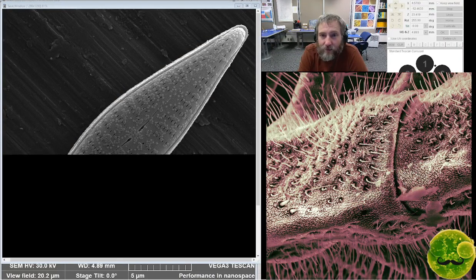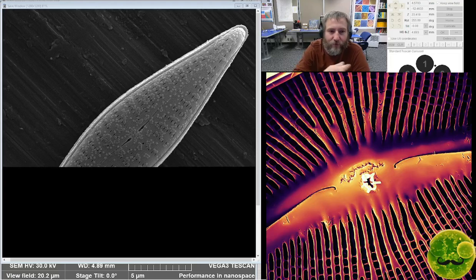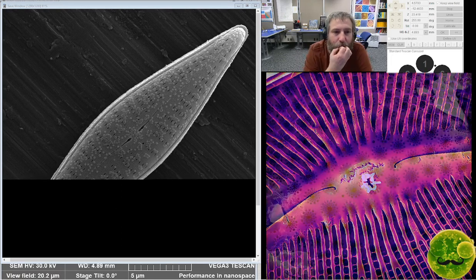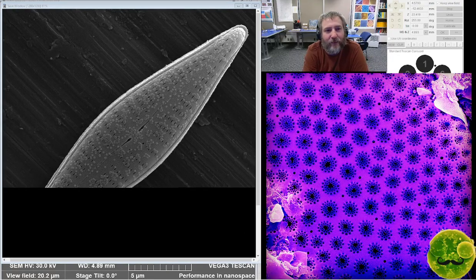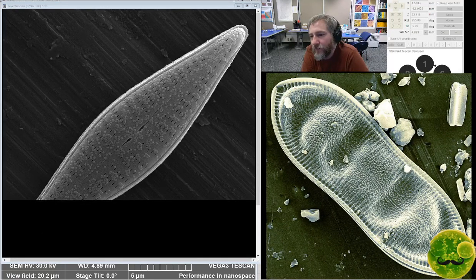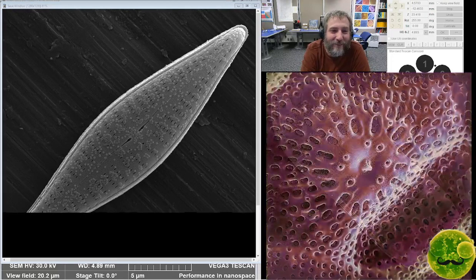the little stubs. So they basically chop them and then grind them to be flat. Those are from the flattening grinding process. And they've got little flecks on them. Those in the background are probably from clay particles sitting on the surface. Speed lines. So they're not tree rings.